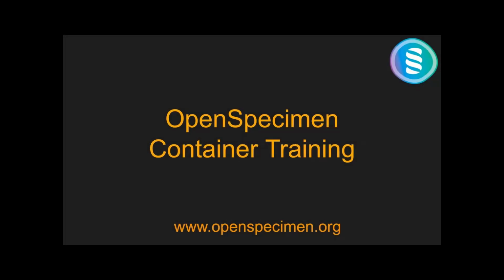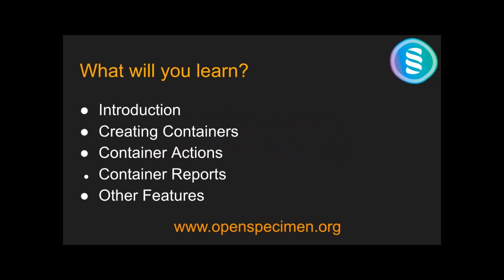Today we will be going over the OpenSpecimen container training. A container is anything that can store samples, or is just a physical location and that kind of stuff. So what we will be learning today is: one, an introduction; creating containers; and some actions that are related to containers. Now these are coming in with the latest versions of OpenSpecimen: container reports and some additional features.